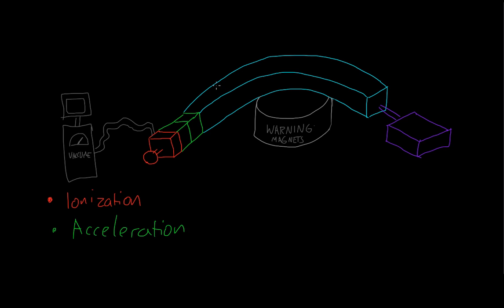That is the bit where they get thrown. This tube in the light blue, as I indicated with the magnet, is where the deflection occurs. So the molecule gets blown out of the path if it's charged and if it's light enough. And then this purple box is where the detection occurs. So these 4 stages you need to know for exams. And that's why I've highlighted them. But let's look more in detail about this.